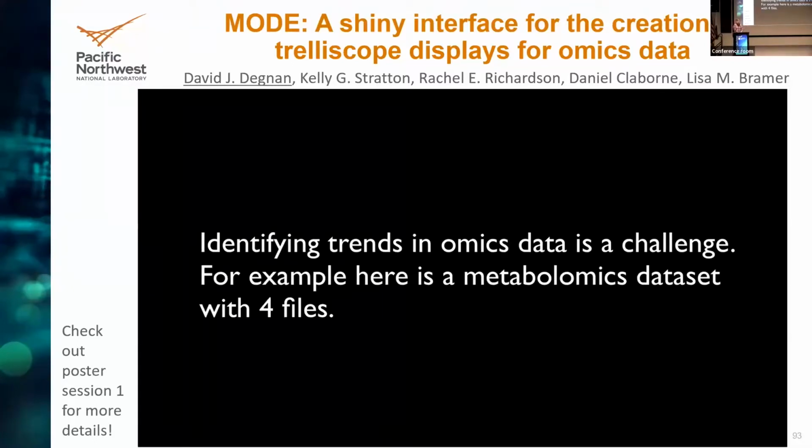I am part of the MAP team here at PNNL. Today, I'm going to be talking to you about the MODE application, which Rachel talked about before, but it's part of helping us explore our omic data at many different steps, in this case following statistics like the output from pmartR. So let's go ahead and start the video.